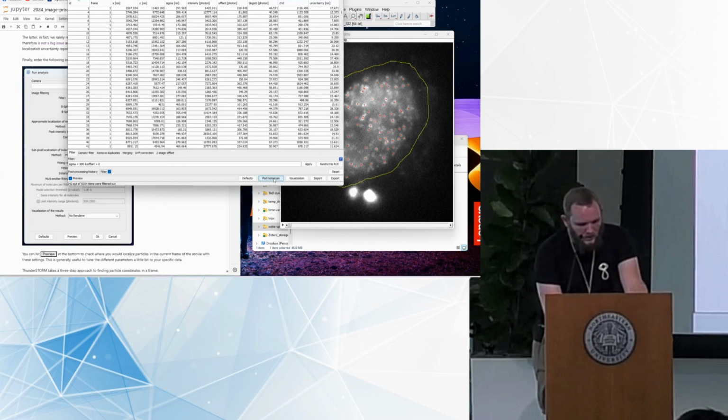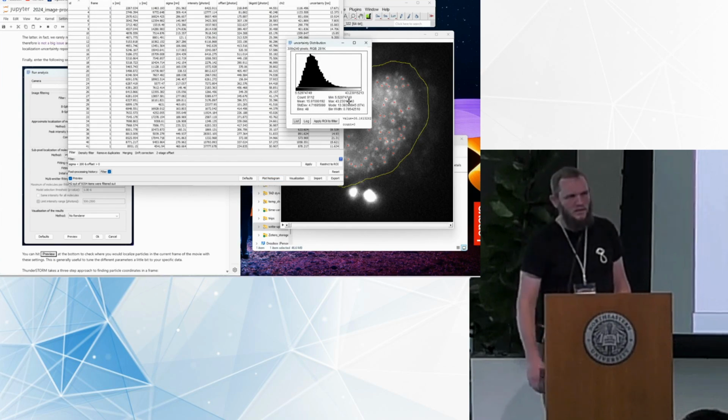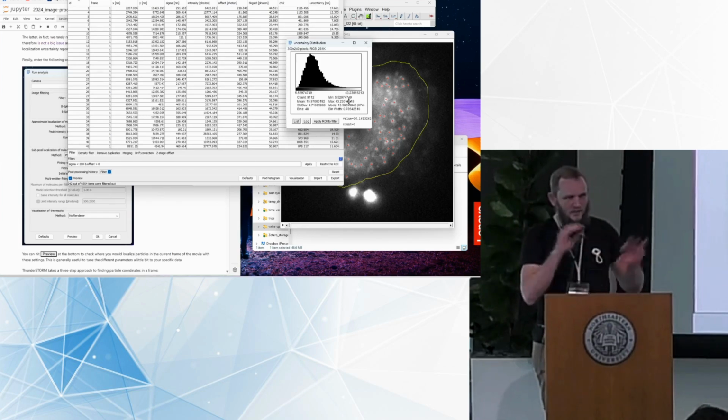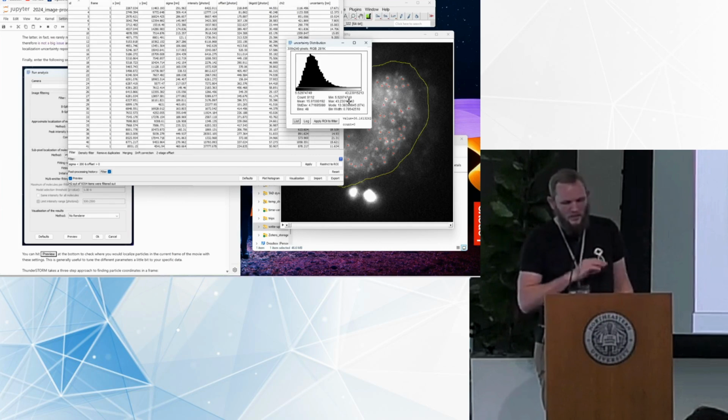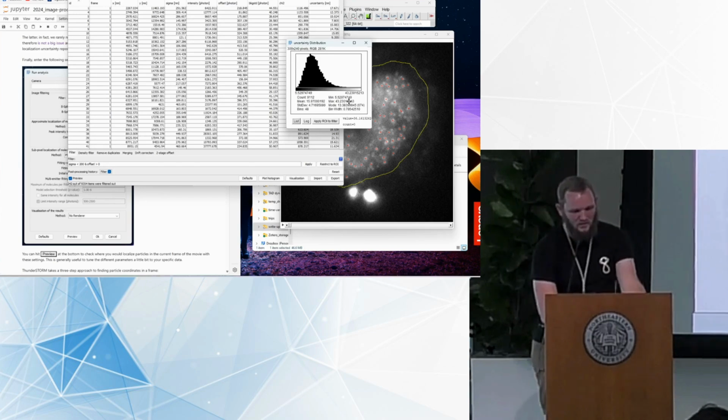And then another thing that's usually instructive to look at is the uncertainty. So the uncertainty that Thunderstorm reports for how well it can localize things, because spots that it can't really localize, where it knows itself already that it's very uncertain where things are, are usually either some dirt or just bad localizations, so it also makes sense to exclude those.